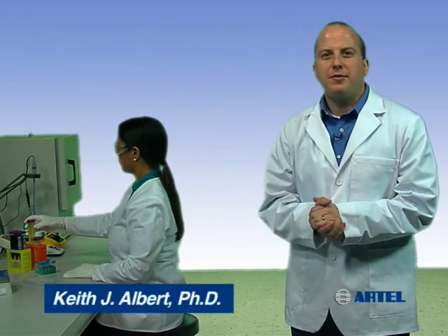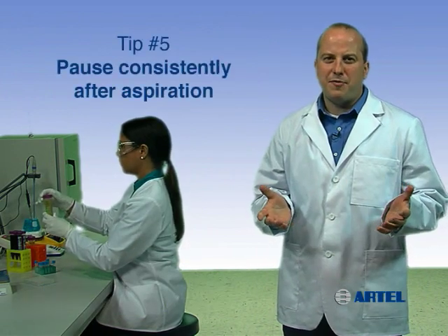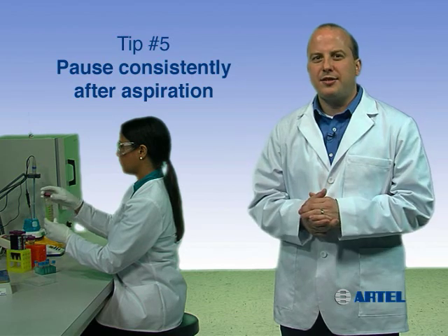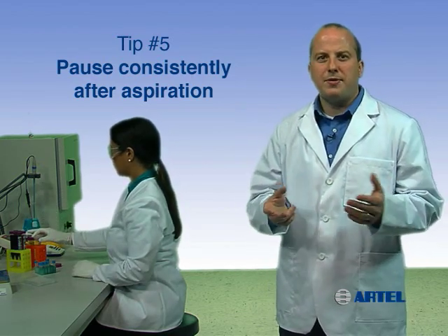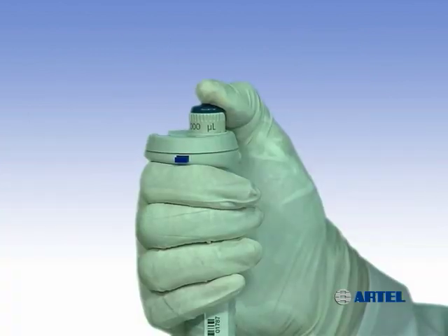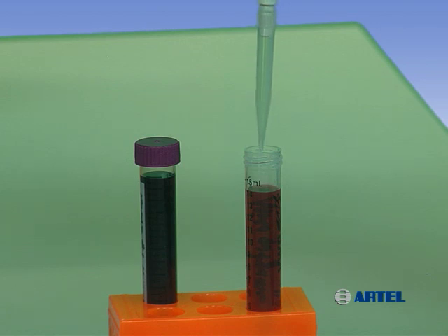Knowing how to properly use a pipette will help you obtain better liquid handling quality in your lab. Pipetting tip number five: pause consistently after aspiration. After aspiration, the amount of liquid in the tip can bounce slightly when the plunger stops. Slow, even plunger release and a consistent, brief pause after aspiration minimizes errors resulting from this phenomenon.